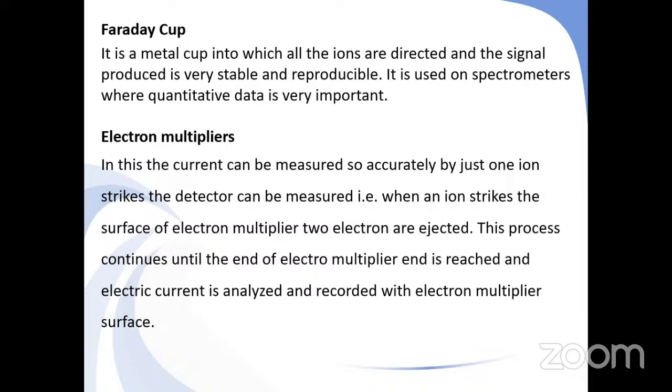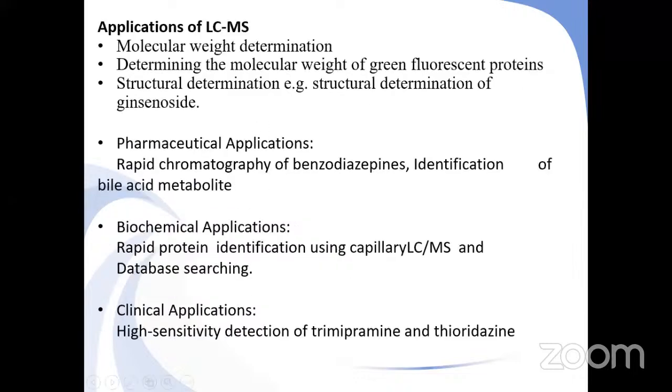Some of the points of the LCMS: generally, it is done for molecular weight determination. LCMS is a technique used for biopharmaceutical analysis. Nowadays we are using Agilent, and the software includes WinLine software, version 5.2.